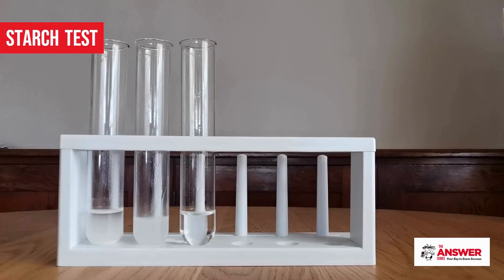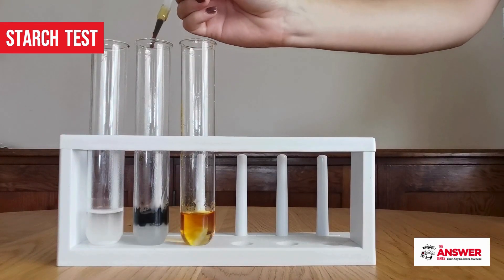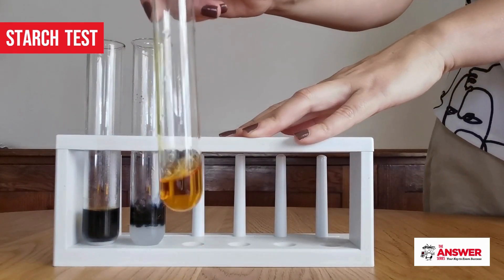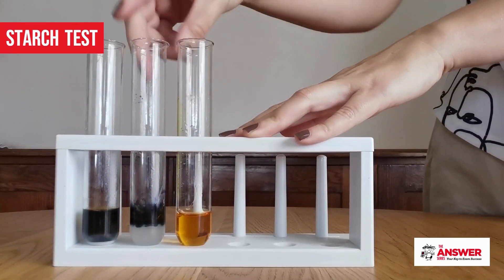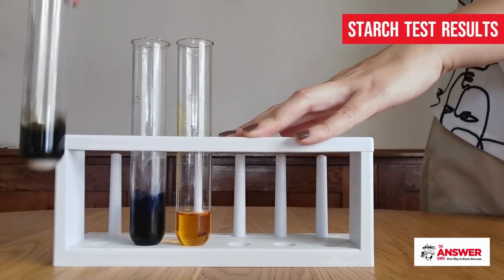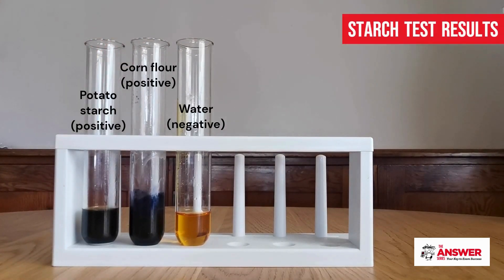To perform the starch test, add your starchy substance into one test tube and water into another. The water will serve as the control so that we can compare the color changes of the test tubes. Add a few drops of iodine to each test tube, gently shake the mixtures to allow the iodine to disperse and observe the color change. A brownish yellow color indicates a negative test for starch, whilst blue-black indicates a positive test for starch.